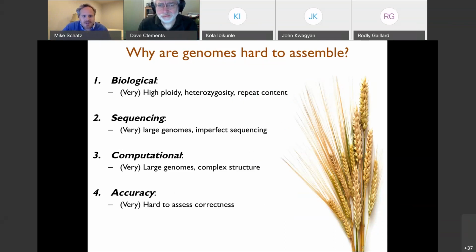It has a much larger genome in addition to that. Other complications: all DNA sequencing platforms have error associated with them. We need to overcome that. We need to come up with faithful reconstructions. Another problem is that the data sets can be quite large, so there's a lot of computational complexity. That's where Anvil and Galaxy come in, where there are a lot of tools necessary to make this efficient. You're not going to be assembling genomes by hand. We need highly optimized software working on big servers, big compute farms, to be able to make this run efficiently.